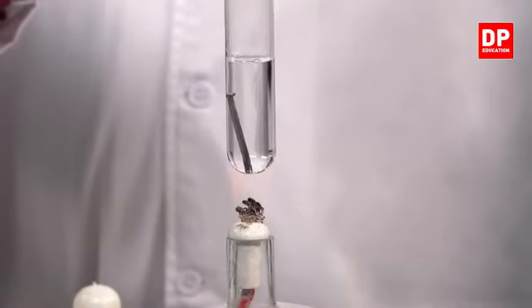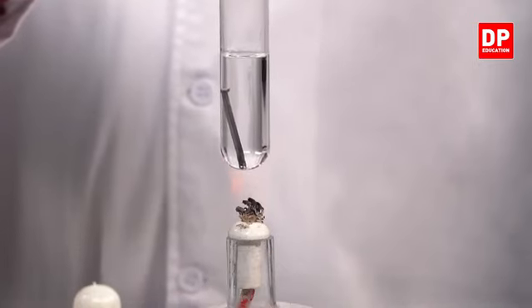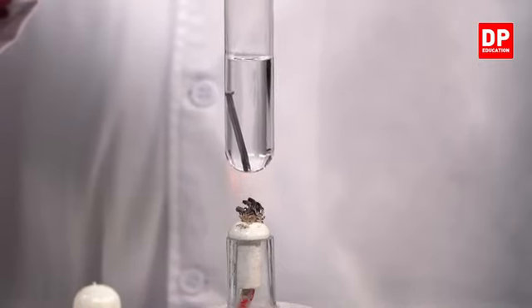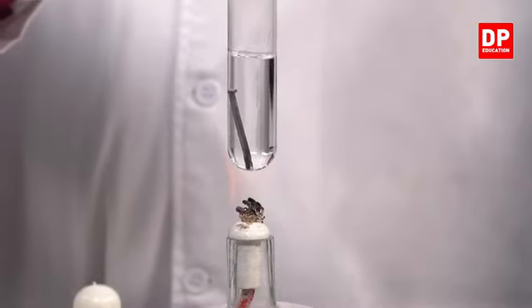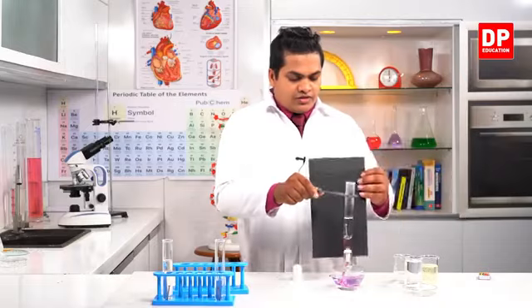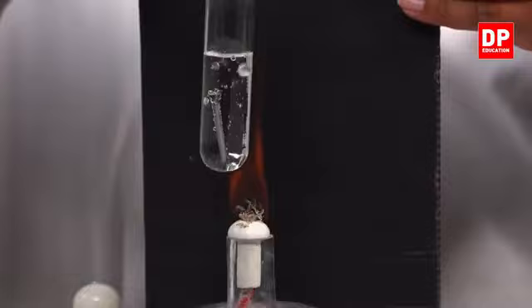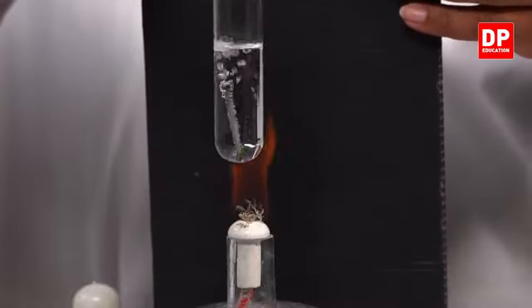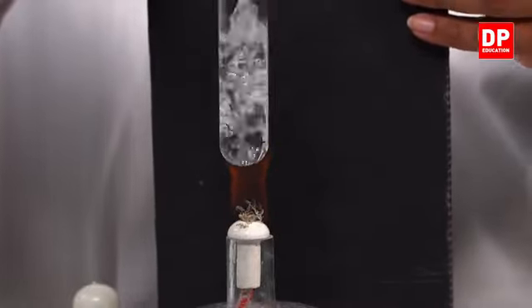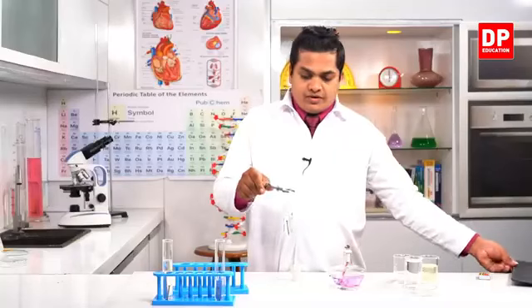Already you can see that bubbles are getting formed inside the water. Those bubbles are the air particles or gases which were already dissolved inside the water. I'll use this black color surface. Here you can observe, see, the bubbles. Right. Now it has boiled very well. So I'll remove it now.